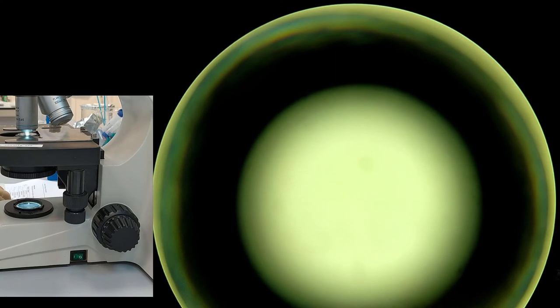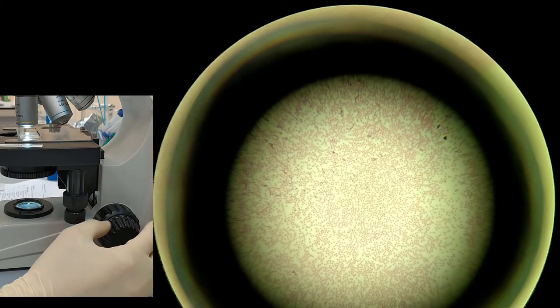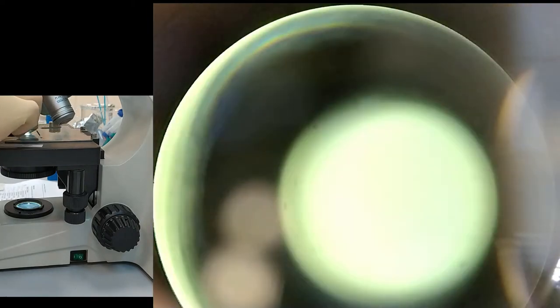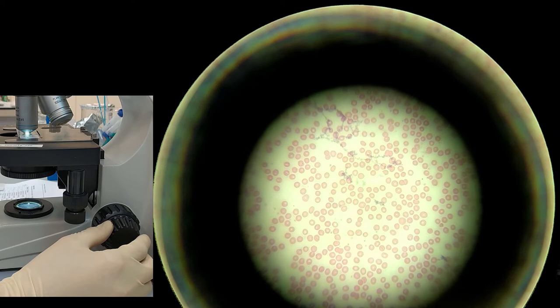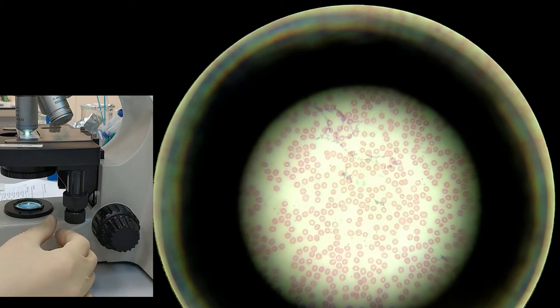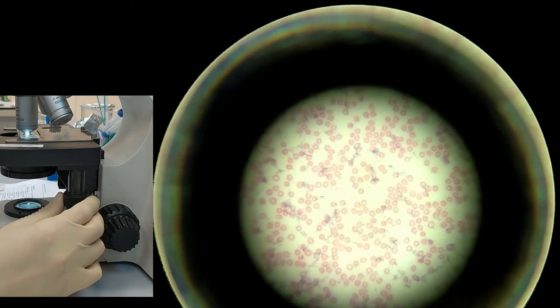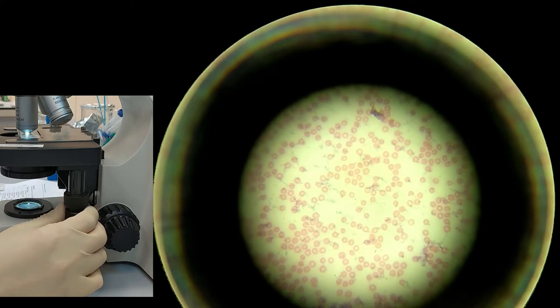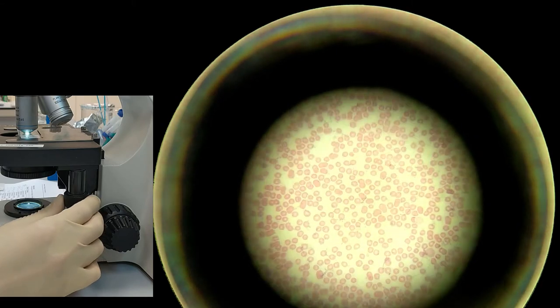Next, we have human blood. The vast majority of these are erythrocytes, and you can spend some time to find the neutrophils, which are the white blood cells.